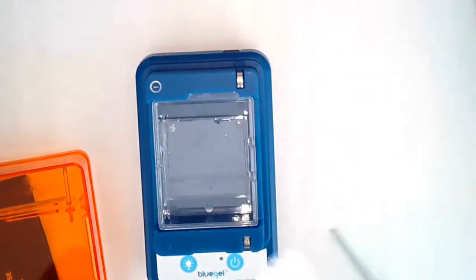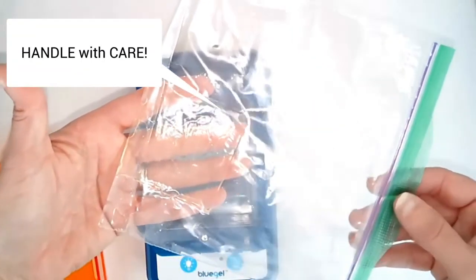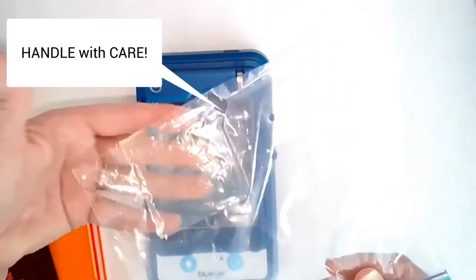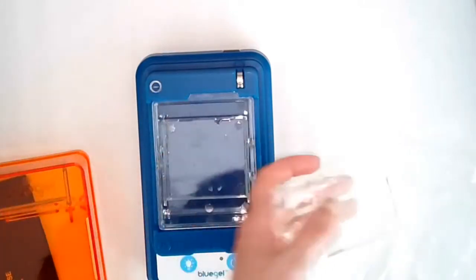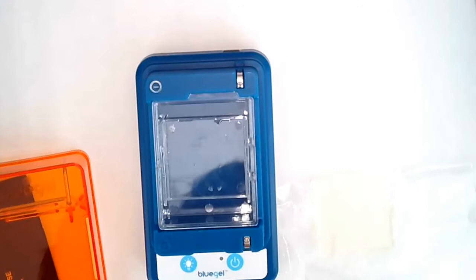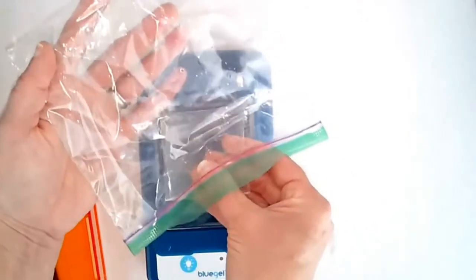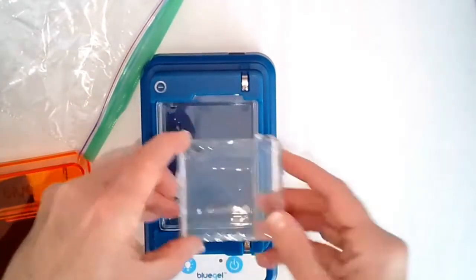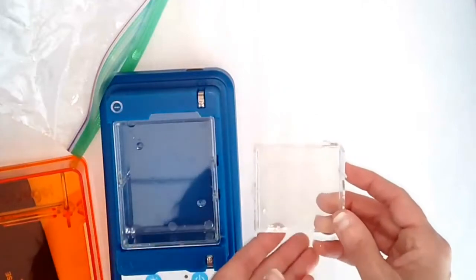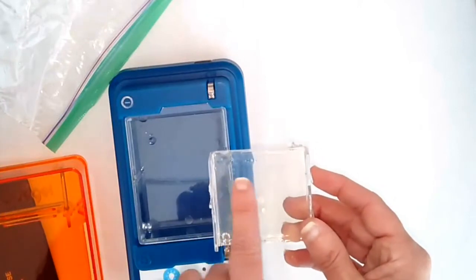Okay, as you may have noticed, the wells are very, very fragile. You need to transfer your gels into the inner chamber very carefully. So to do that, again, the gel is fragile. You will gently slide the gel from the Ziploc baggie into the innermost tray. If that's difficult for you, you can always take the inside tray out and do it that way and then transfer. Whatever's easiest so you don't break the gel.